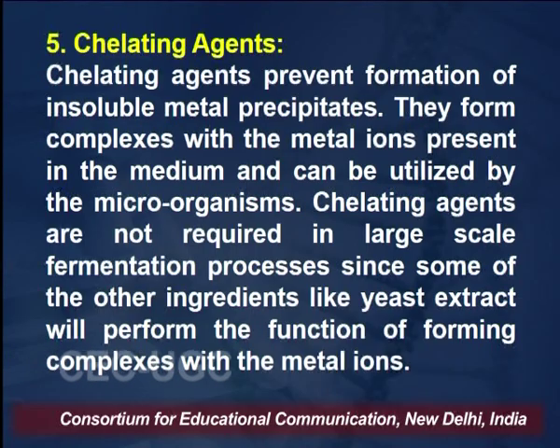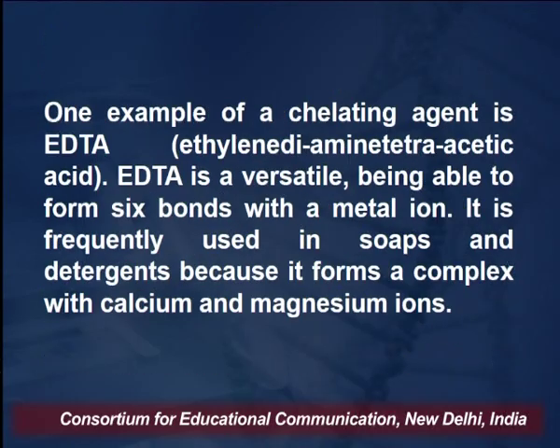They form complexes with the metal ions present in the medium, which can then be utilized by the microorganism. Chelating agents are not required in large scale fermentation processes since other ingredients like yeast extract will perform the function of forming complexes with the metal ions. One example of a chelating agent is EDTA.